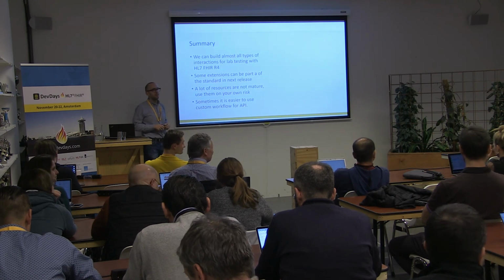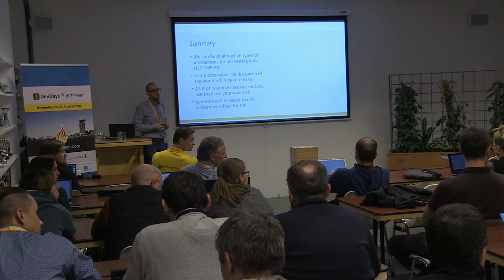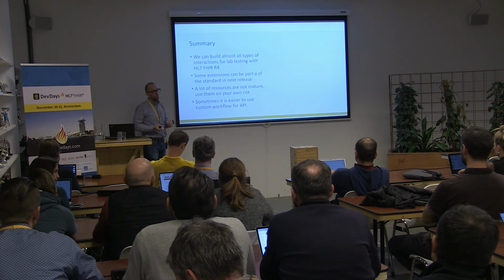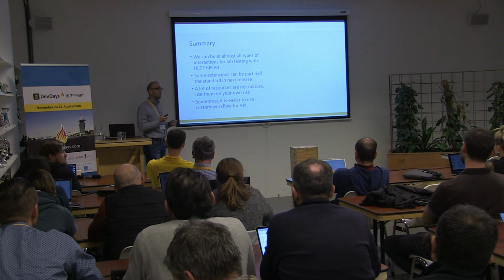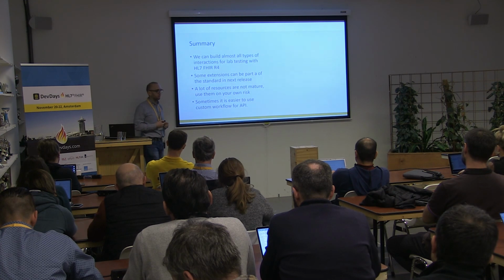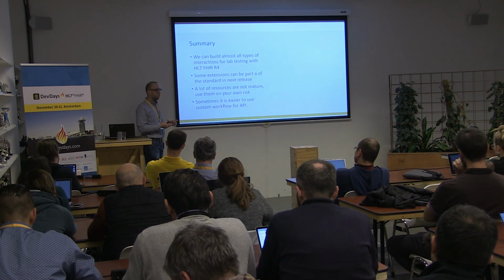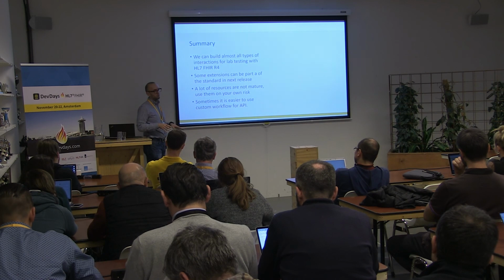Yeah? Question, how did you consider labels exchange as part of this process? Is it somehow considered? You mean how container labels? There are two ways to do it. The first way is not using the API as well. Our customers can send blocks of labels which can be put on containers. So it's an absolutely offline process.